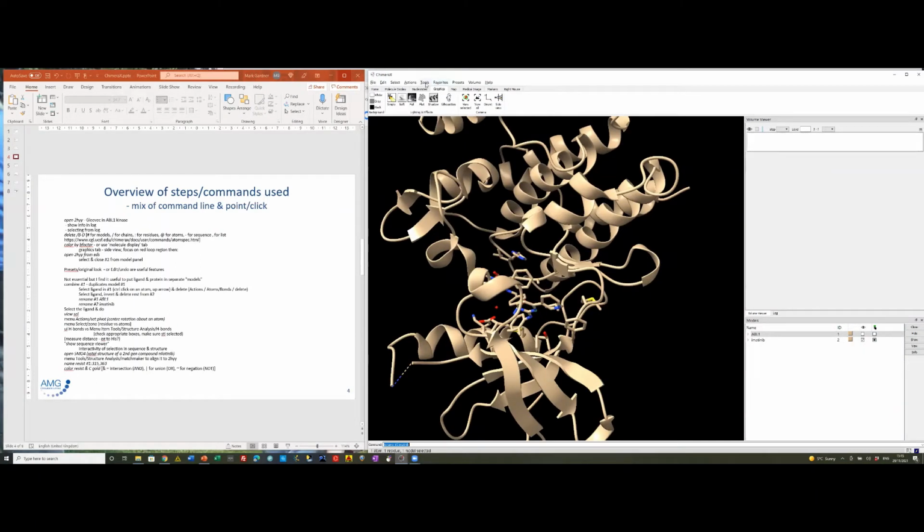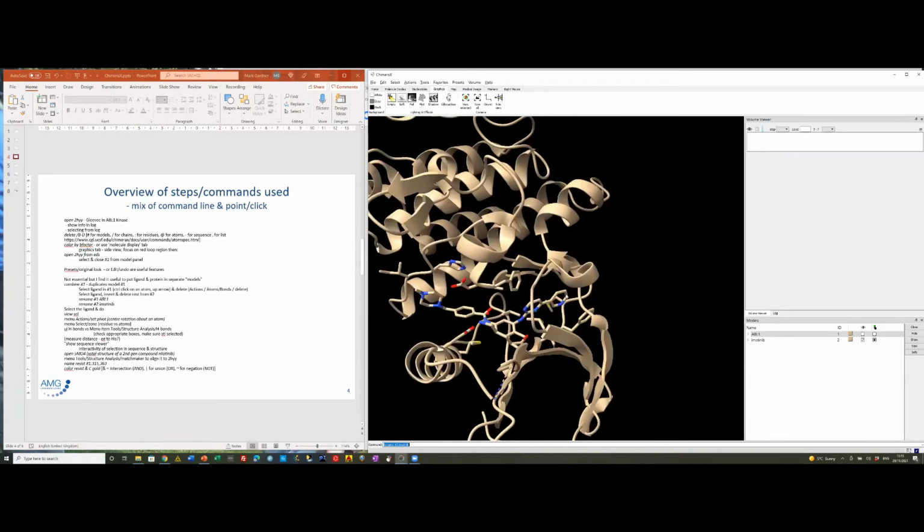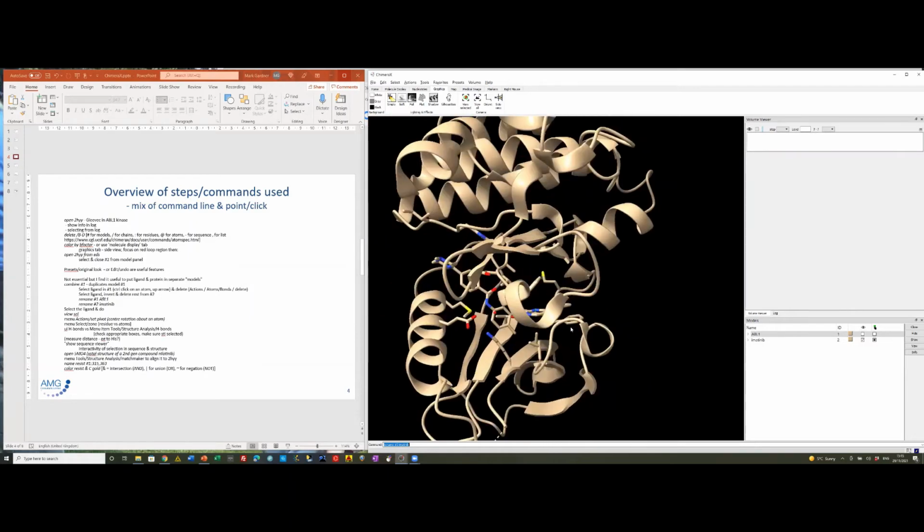and then under presets, I think. Maybe it didn't. Actions, that's where it is. Set pivot. So that's setting the center of rotation about that atom.